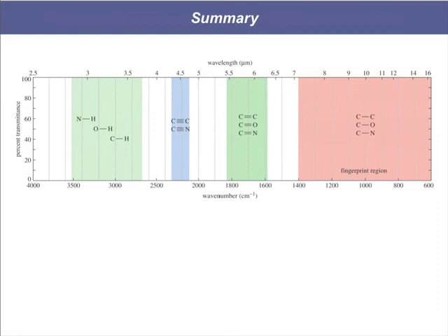And then we've got our light atom regions. So carbon to hydrogen, oxygen to hydrogen, and nitrogen to hydrogen. Remember what those were. For carbon, if it was sp3, it was 3000. If it was sp2, it was around 3100. And if it was sp, it is around 3300. The OH was broad, whether it was centered around 3300 for the alcohol or centered around 3000 for the carboxylic acid. And the nitrogen tended to be around 3300, not quite as broad as the alcohol, but also including spikes.